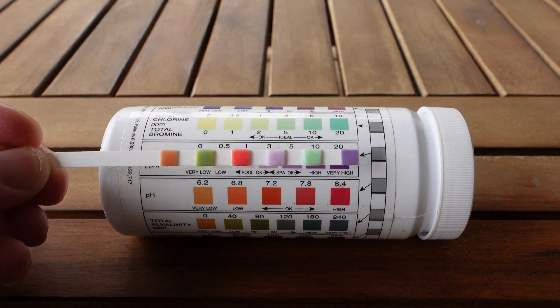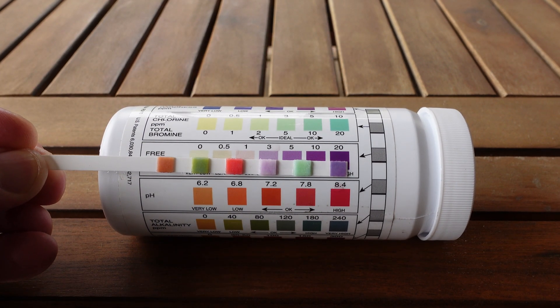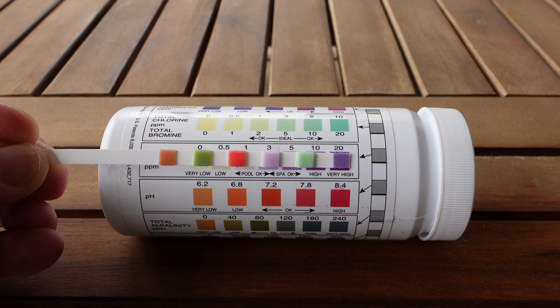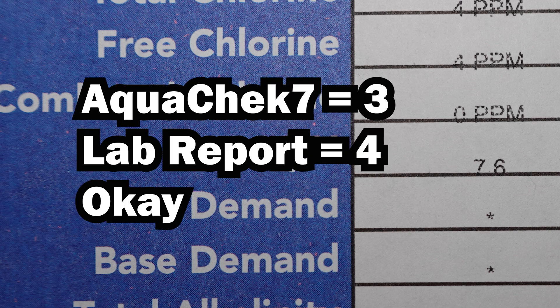Free chlorine is a very close match to the 3 parts per million square on the bottle. It may be slightly darker than that, but not so much that I can call it a 4. I'll call this a 3. The report has 4 parts per million for free chlorine, so we've got a first slight disagreement between the two results.